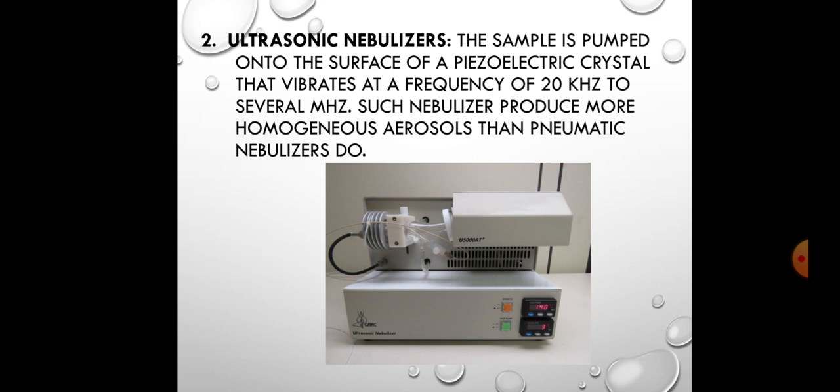Such nebulizers produce more homogeneous aerosols than pneumatic nebulizers do. So this is a better nebulizer than the pneumatic nebulizer, and it is more expensive.